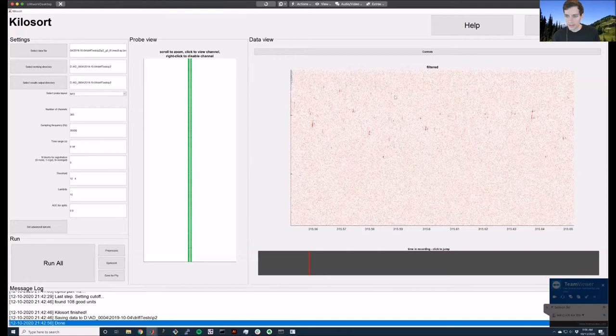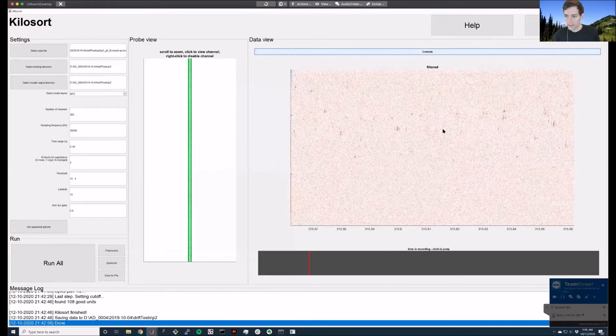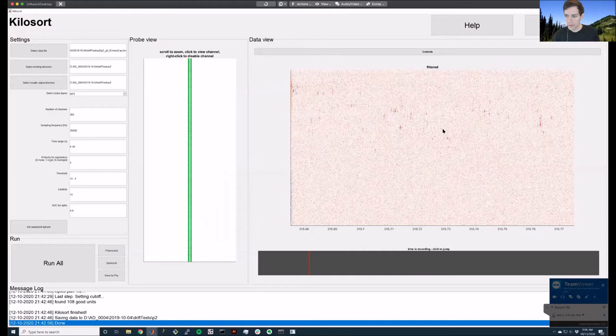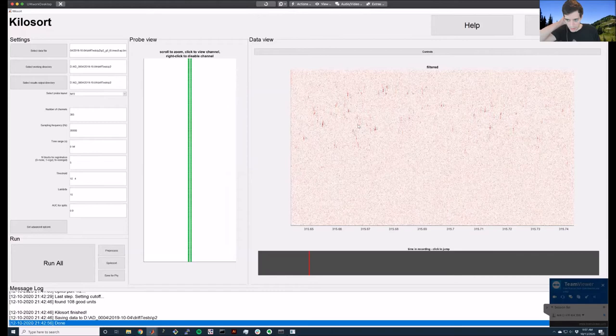For navigation, scrolling with Alt, Shift, or Control will zoom or scale. You can scroll to slide through the recording, and you can zoom in on different channels as needed.